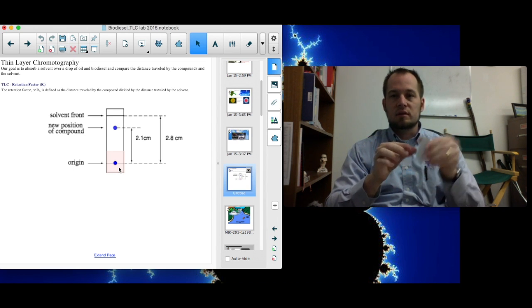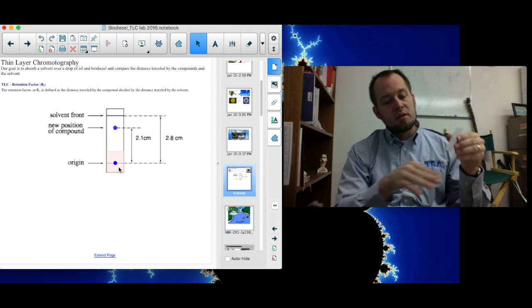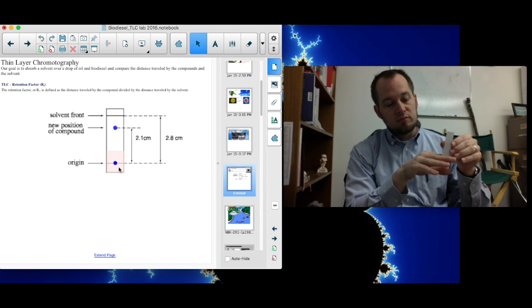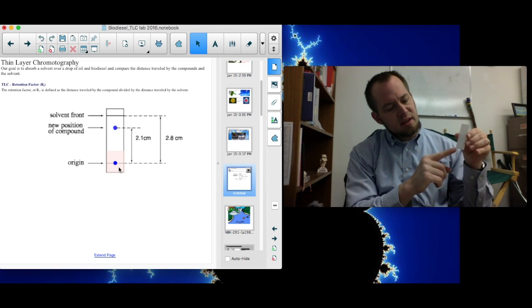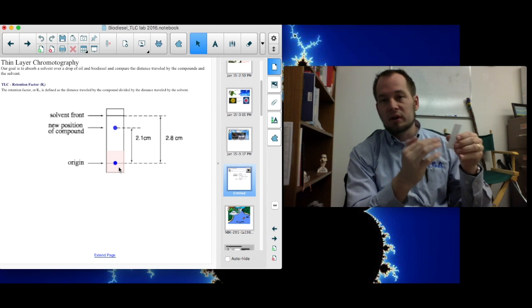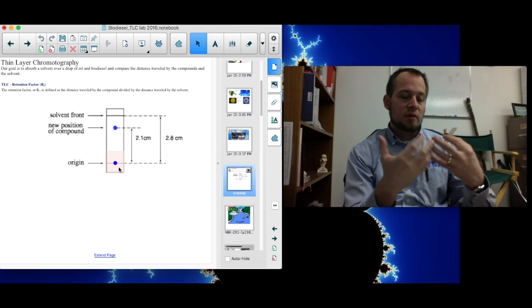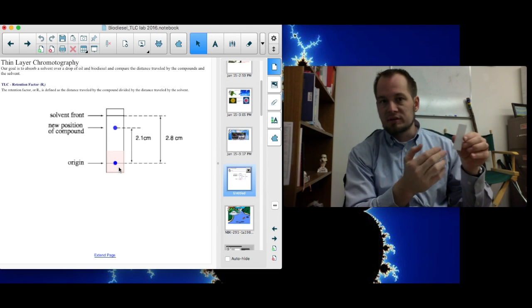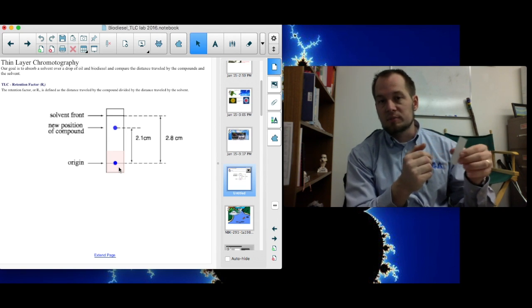Okay, so you would take this thin layer. You would put a spot of the substance you're trying to test, towards the bottom, and then you would dip it in something absorbent, another solution of some sort. You can use almost anything. You usually don't use water, but you can use other substances. You dip it in that, and as that substance absorbs up this thin layer plate, it'll pick up that spot of the thing you're trying to determine. Basically, the amount of interaction, the amount of attraction that your unknown substance has to this known solvent, as that solvent travels up this plate, that interaction is going to tell you what kind of substance you have in that spot that you just put on here.